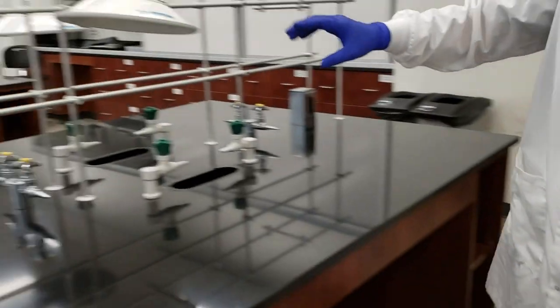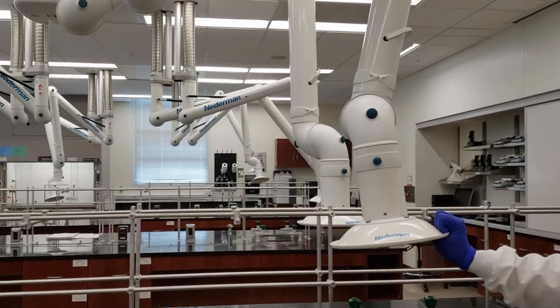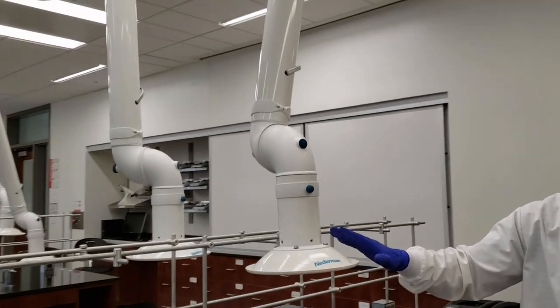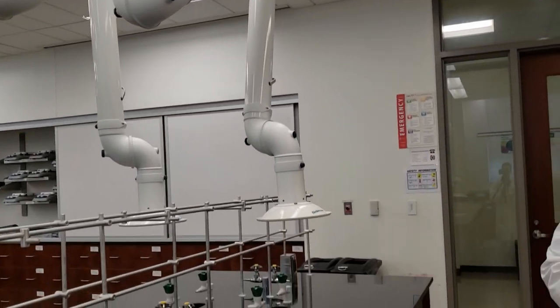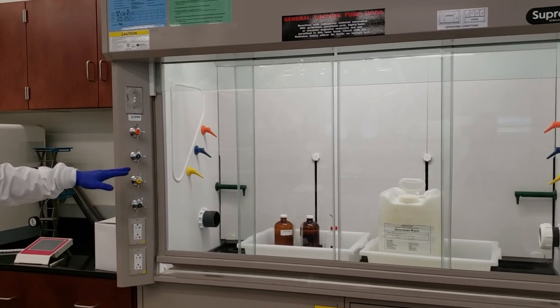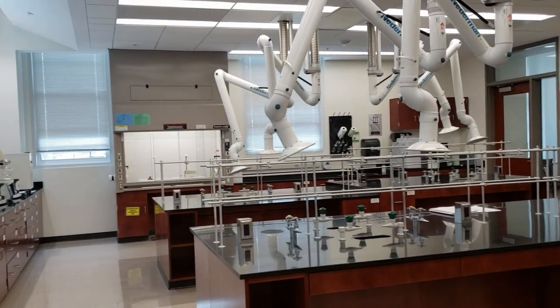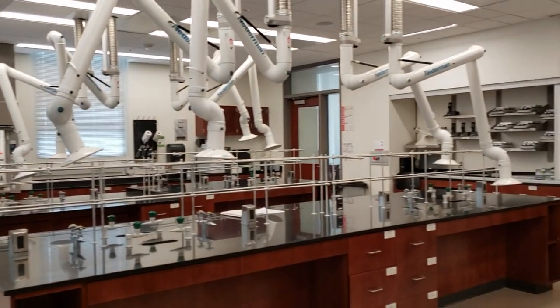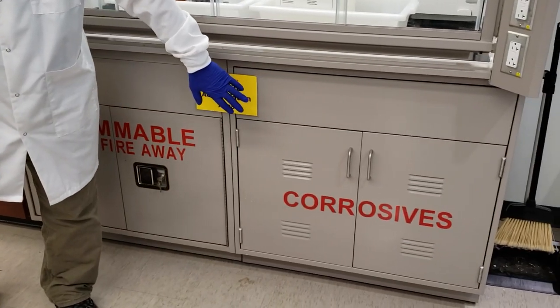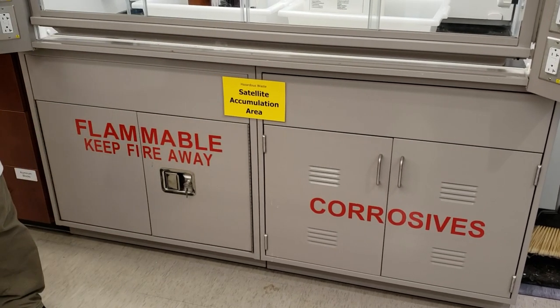Behind us we have our snorkel system, individual snorkels for each student workspace set to our house vacuum. We use these to evacuate and ventilate any fumes generated during reactions to keep us from inhaling anything dangerous. We have one snorkel per station. Back here we have our fume hood. All hazardous waste buckets and starting materials are housed in the fume hood. We have two of these, one on each side. You'll dispense all liquids inside these hoods. Underneath each hood we have a flammables cabinet and a corrosives cabinet for additional hazardous chemical storage, which only TAs access.